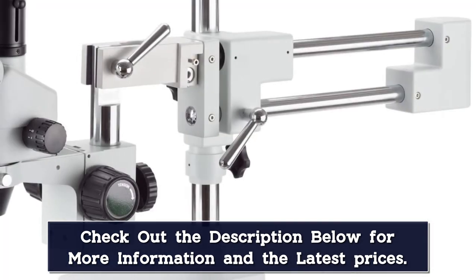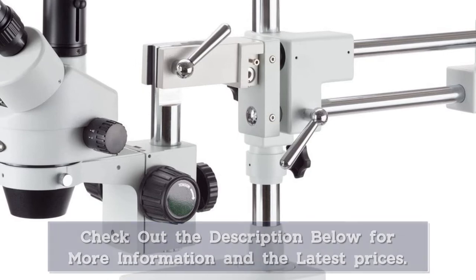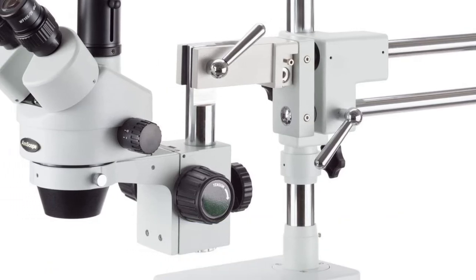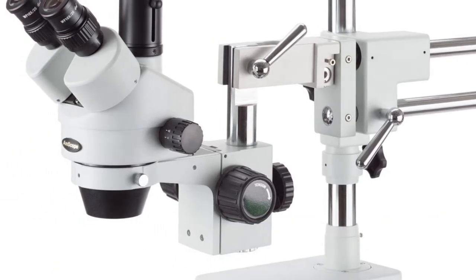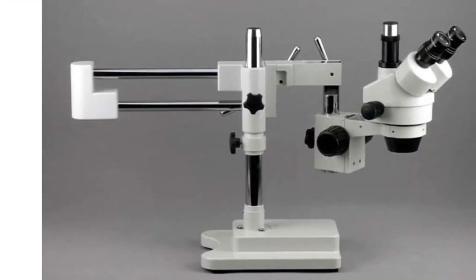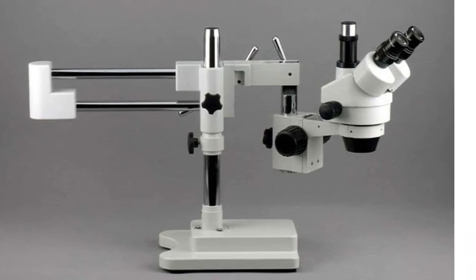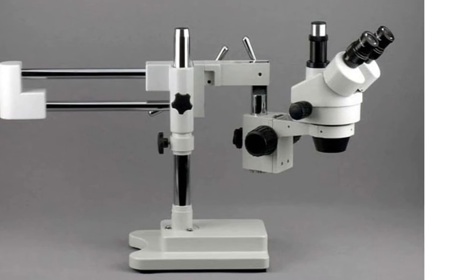For the uninitiated, the field view of a microscope is the area you see when looking through the lens. The wider it is, the more of your object stays in focus. The SM4 NTP microscope from Amscope allows you to view more of your target at once, meaning it's easier to work. Also, if you're taking photos, you can get a clearer image of what's happening through the lens.